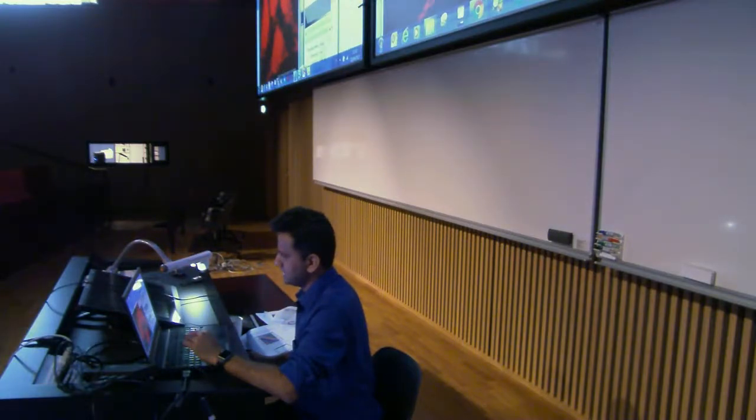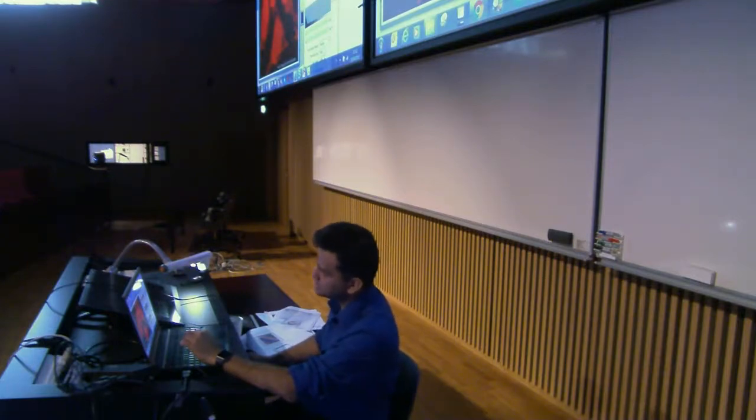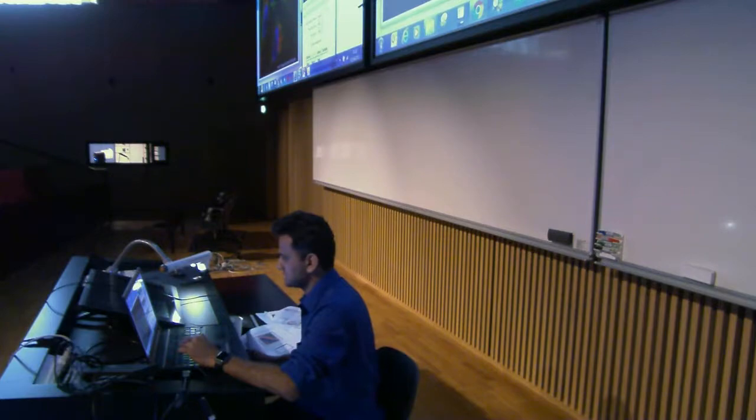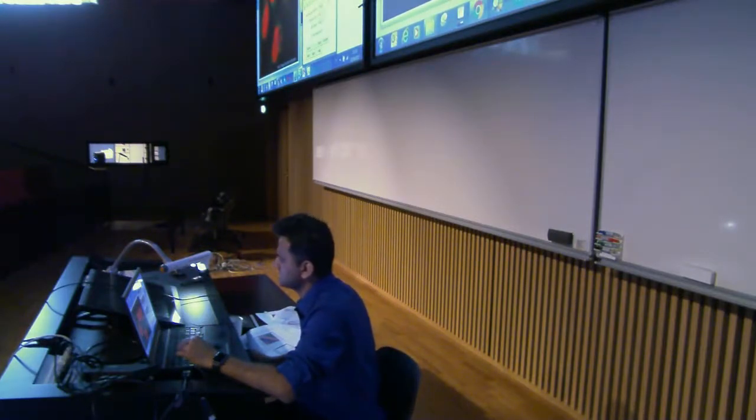So the reason why it didn't work is because our image was in a composite mode. Make it composite to RGB, and then you can apply this color thresholding on this. So it HSB to RGB. And now you see what happens. So maybe I'm interested in segmenting the dark background, B, default. You see here? So I can only control one particular channel at a time in order to do a segmentation.